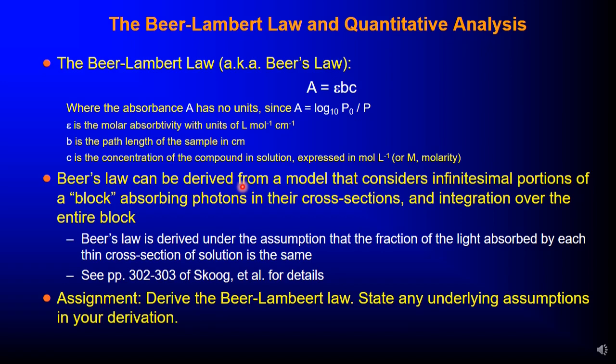So if we take that the absorption of electromagnetic radiation by the sample is uniform, then to get the amount or the absorbance, we will do integration.